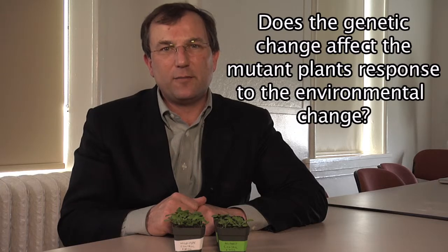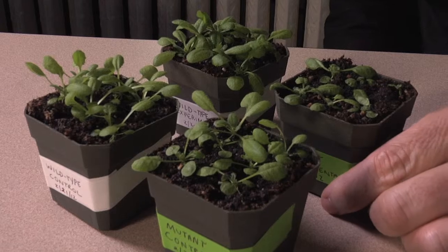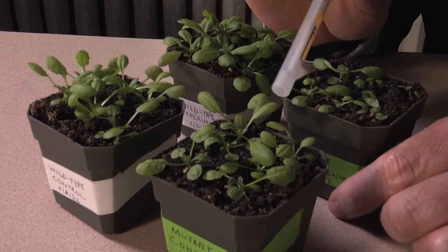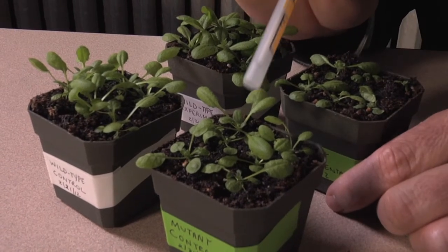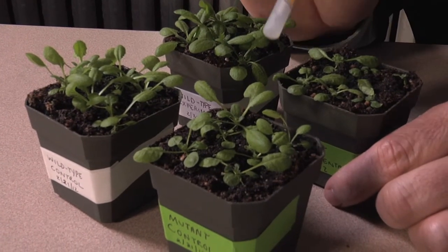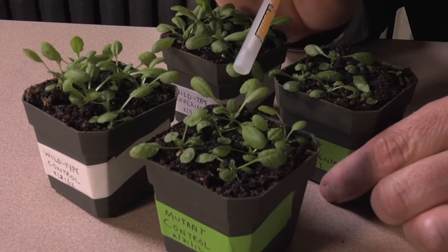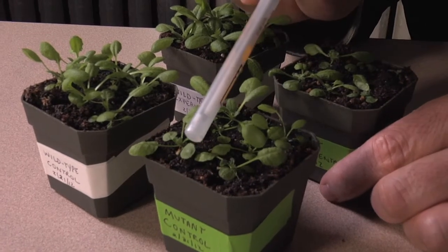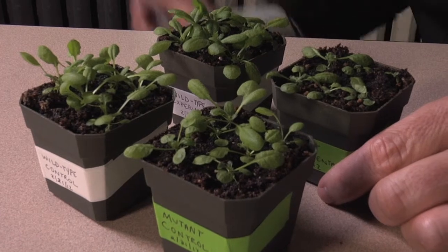Let me give you an example. Okay, so here is my mutant experimental pot, and I'm going to look at these other 2 comparisons that I've made. First, what's the effect of the genetic change? And I can see in the mutant here that it's not doing as well as the wild type. I know that because they look smaller. That's something that I can confirm with a quantitative measurement by measuring the distance across the plant itself.